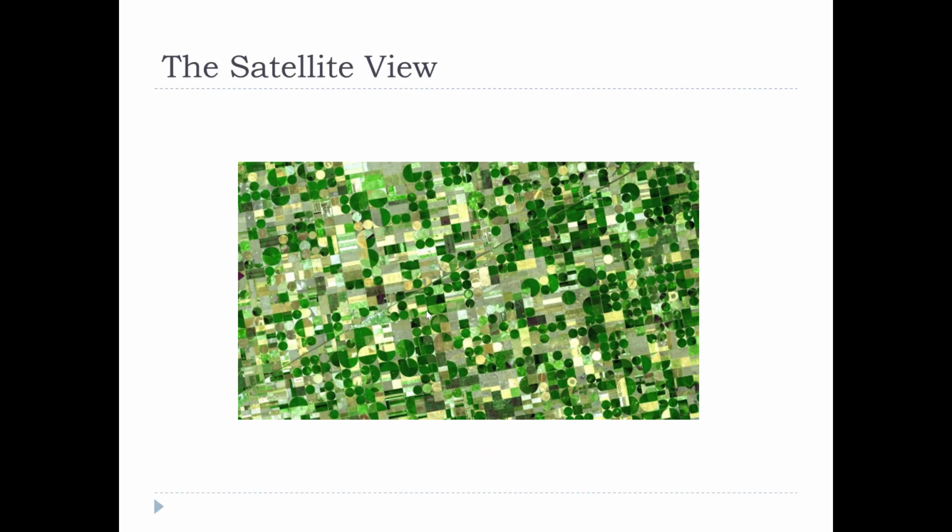So a lot of tools that get produced sort of hurry you past all the grubby details of what's going on, and Brian's been showing you some of the grubby details and why they become problematic. But if you use a set of tools that give you this kind of view, which is a true satellite image, you can learn something from it. So we can learn that there's a lot of center pivot irrigation going on, and we can wonder, well, certainly there's difference in expression, and we can wonder, what's going on with these plots?